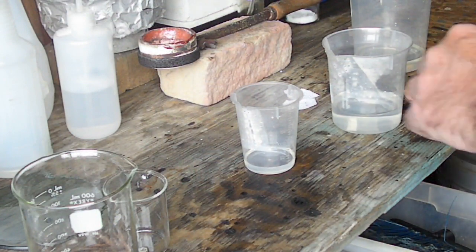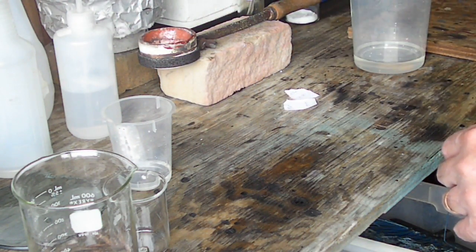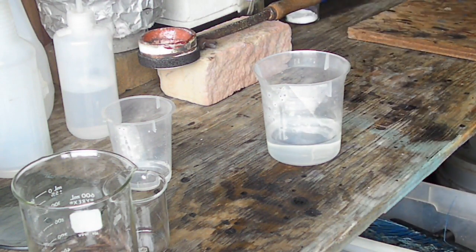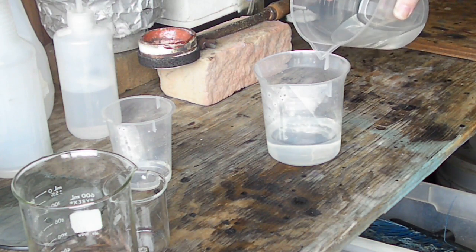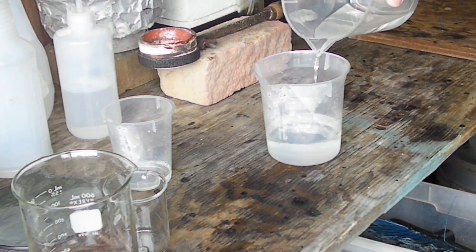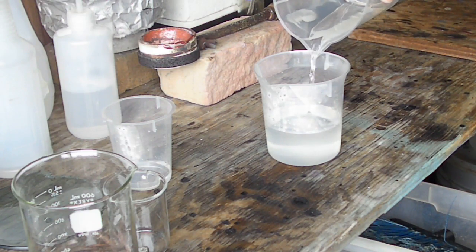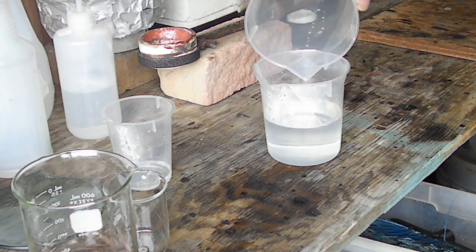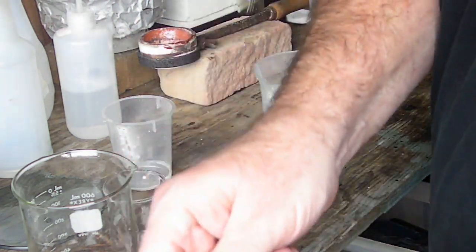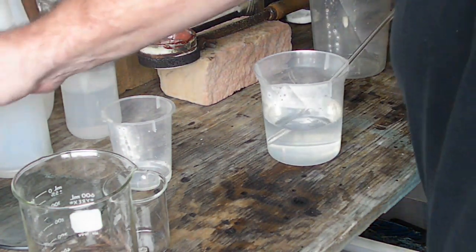We've got our first little batch mixed. This is my distilled water — I've got 150 mils here — and I've got 150 mils of nitric acid. I'm showing you this because you always want to add your acid to the water, not your water to your acid. The reason is that if there's anything that's going to cause a reaction and you're dumping water into the acid, you can get quite a violent reaction. So make sure that whenever you're mixing acids, you add the acid to the water.